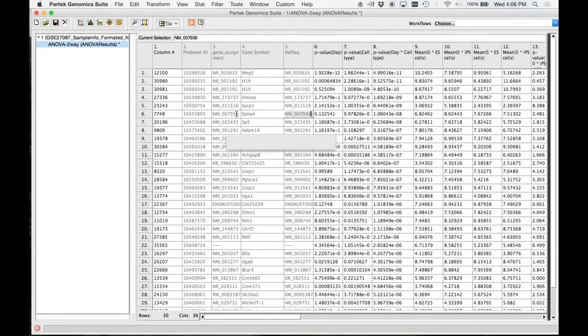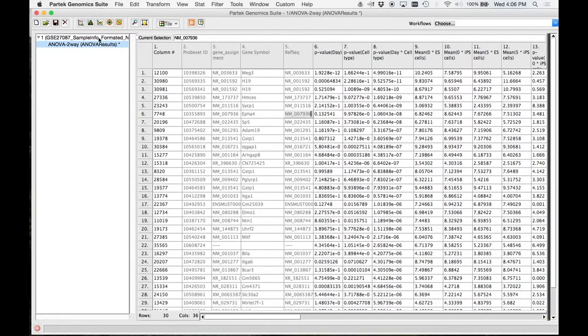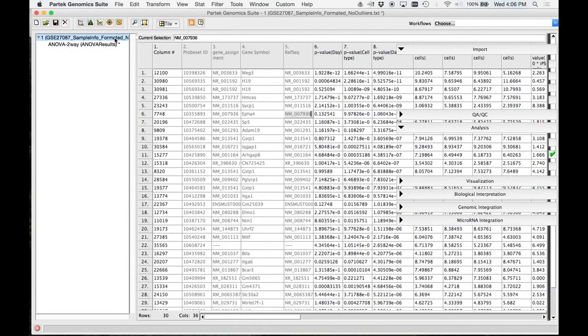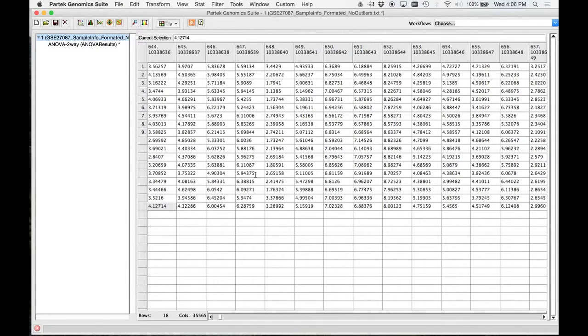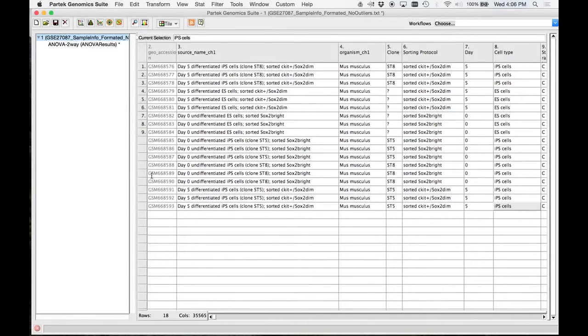Here's what we're going to do. These are the genes that we feel changed due to both differentiation state and this different cell type. I want to see it in this data set, but again, we have 35,000. What I want to do is I want to limit this data set just to the list that I produced in the ANOVA.